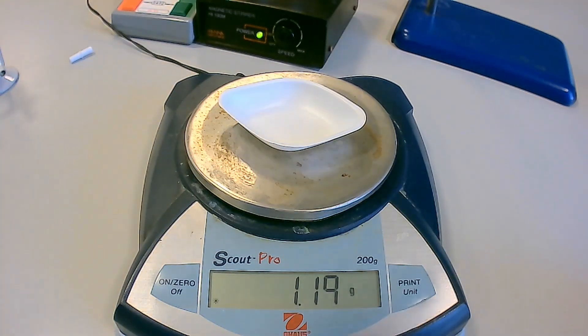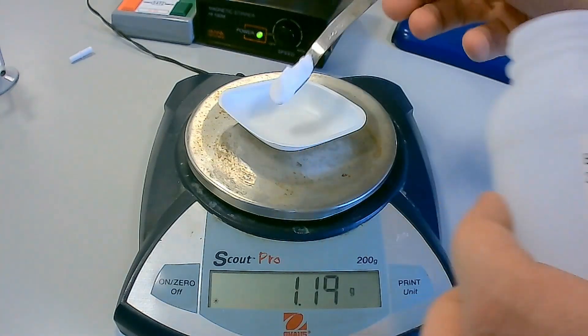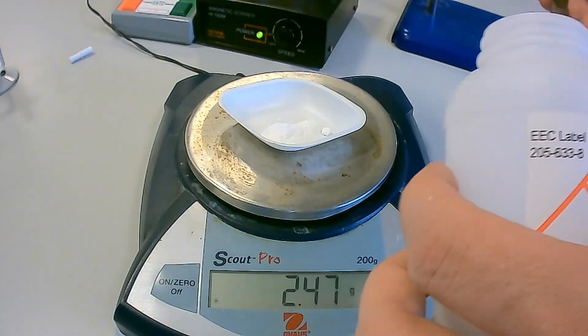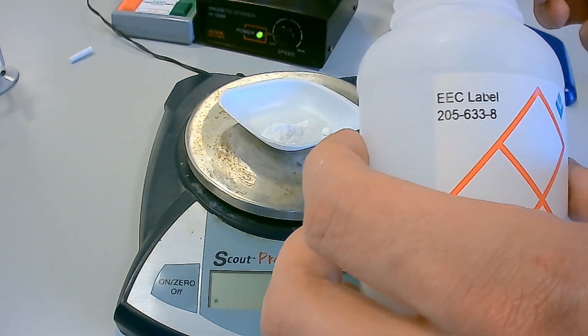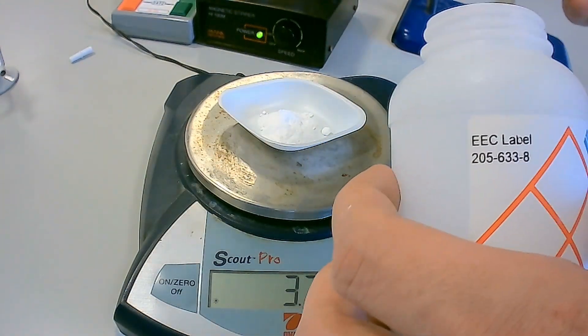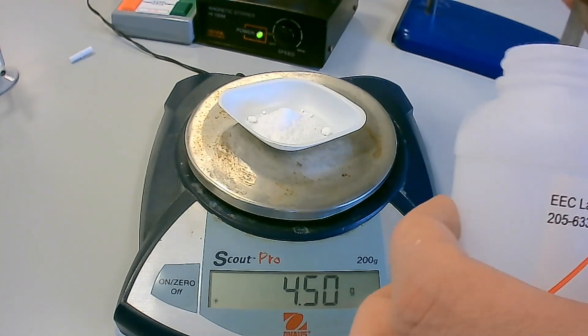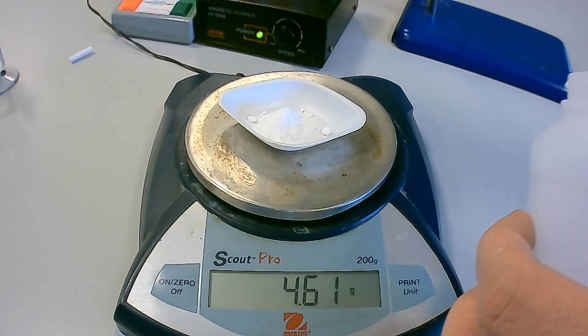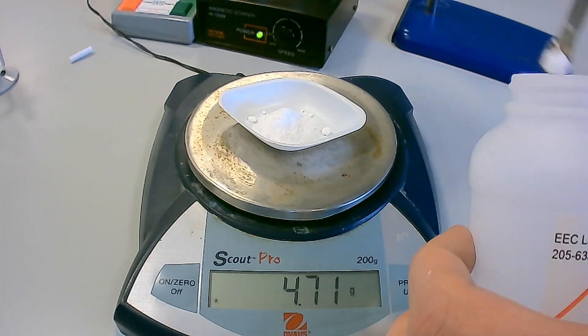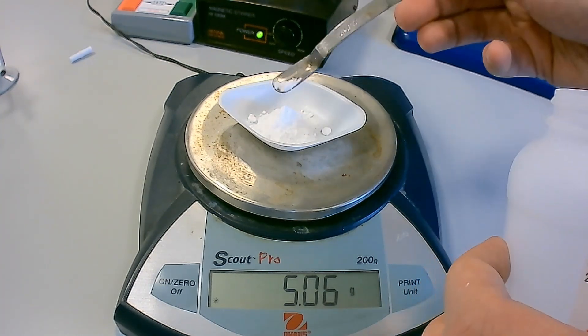This experiment is then repeated but using sodium hydrogen carbonate instead of anhydrous sodium carbonate. Place a clean weighing boat on a zeroed balance. Record the initial mass of the weighing boat in a suitable results table. Using a spatula, transfer between 3.5 to 4 grams of sodium hydrogen carbonate to the weighing boat. Record the mass of the weighing boat and sodium hydrogen carbonate in the same results table.